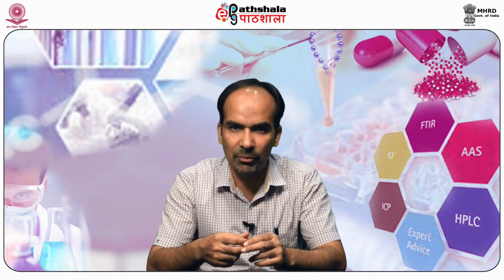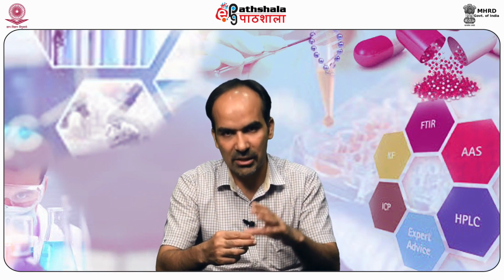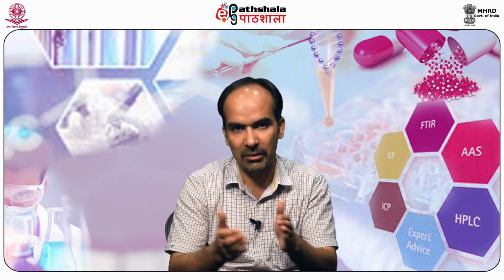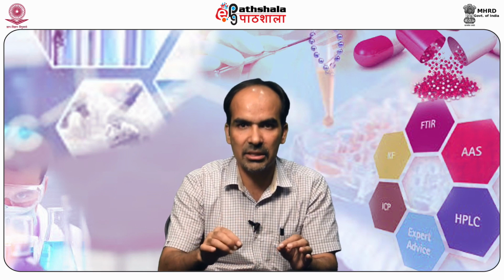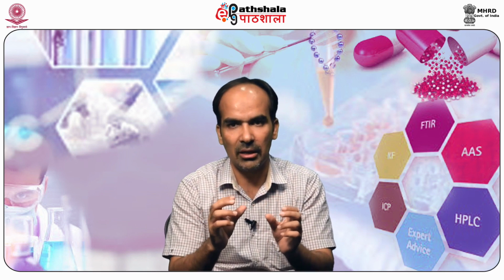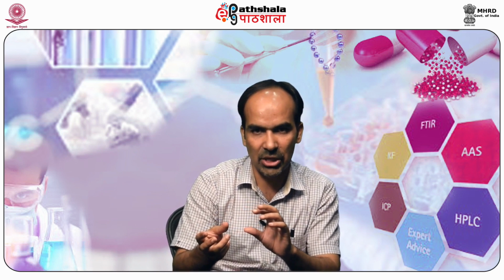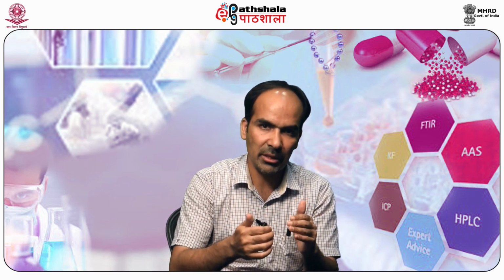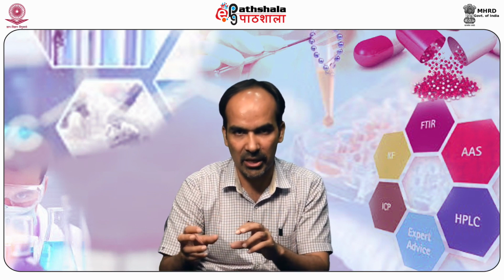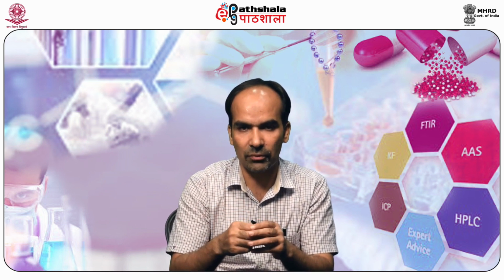Another important analysis is on the basis of IR and near IR. As I told you, in case of UV, the incident light has the energy that brings about electronic transitions. But in IR, low energy light wavelengths are made to fall on the sample. These energies are only sufficient to bring about small vibrational and rotational changes in the molecule. These are characteristic changes that take place within molecules. The absorption of these wavelengths results in an IR or near IR spectrum, and the analysis of IR and near IR spectra is the basis of this analysis.